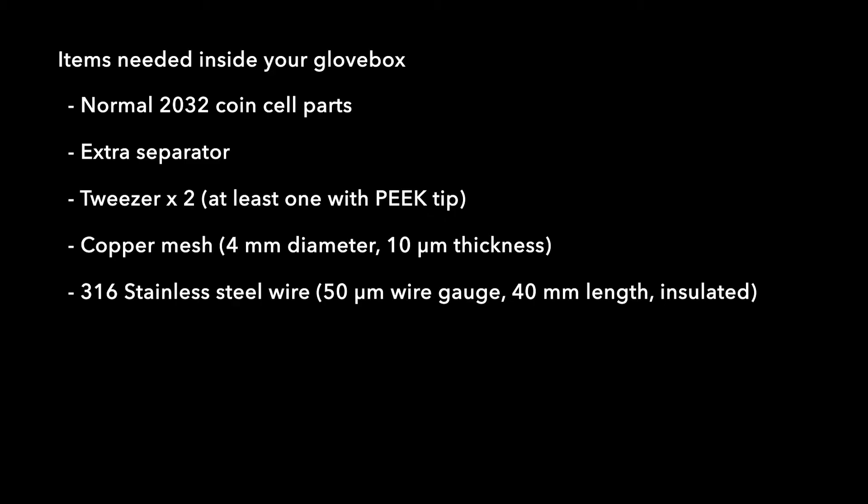Now let's get right into it. We will be using 2032 coin cell parts for this assembly. In addition to the typical things you need in your glove box, there are a few more items you need to prepare.